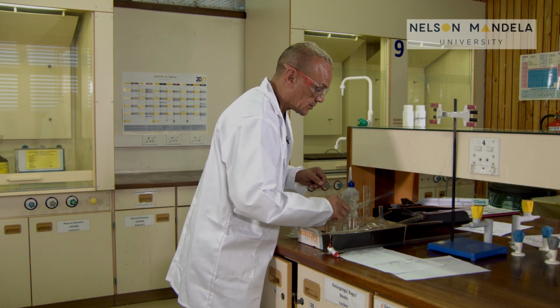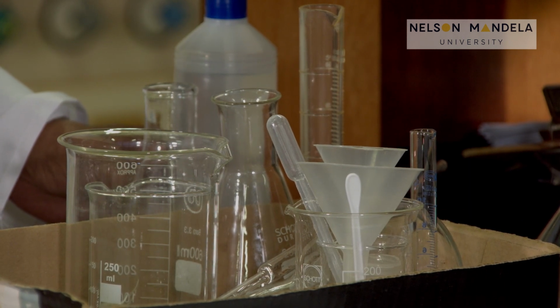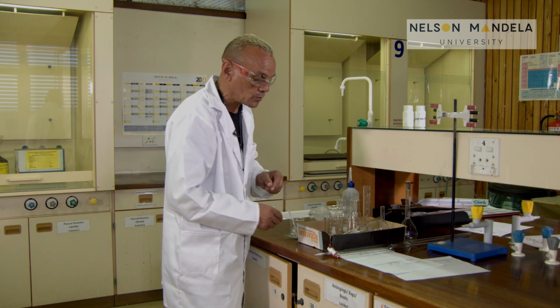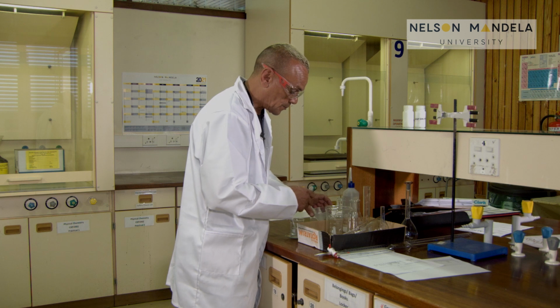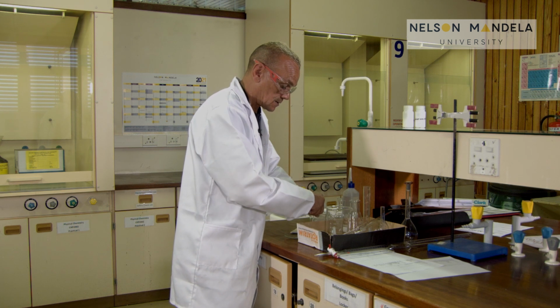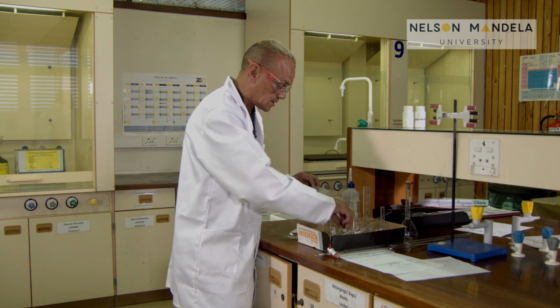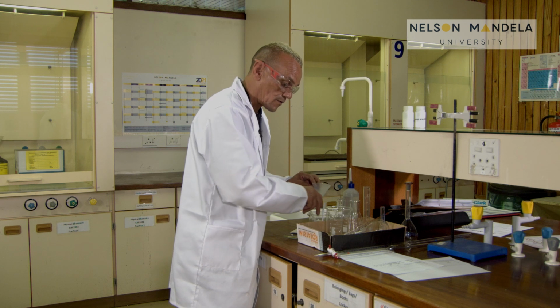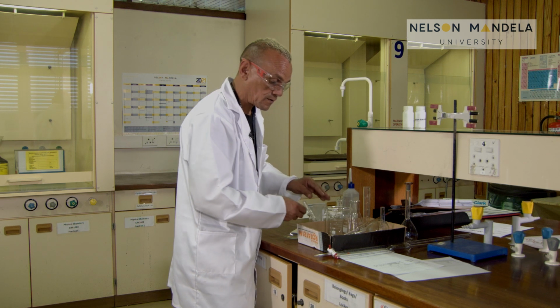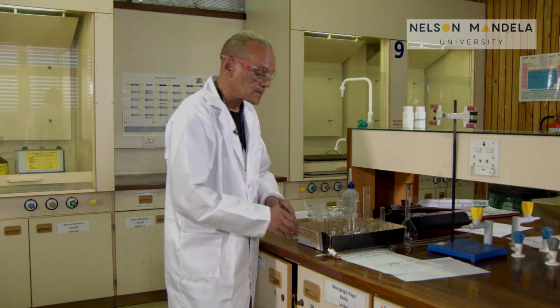So basically you have quite a variety of glassware which you need to know, what they are and how to use them and when to use them. So it's going to be very important for you to know these things. An assignment will be sent out to you to identify these, and as soon as we start with our experimental work, you will be able to use all of it for specific purposes. Like I've mentioned, this glassware is very expensive.